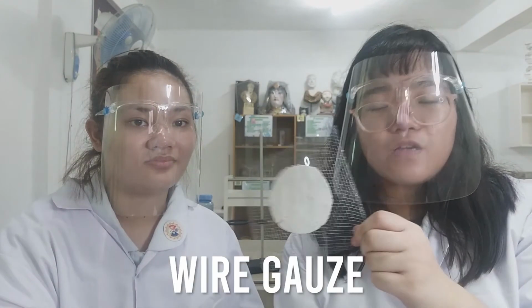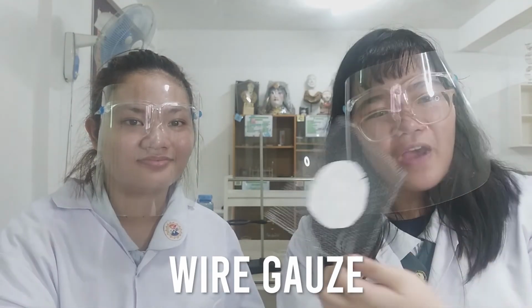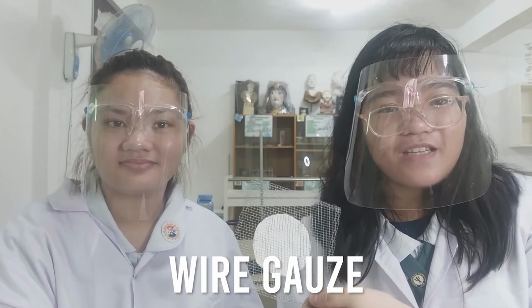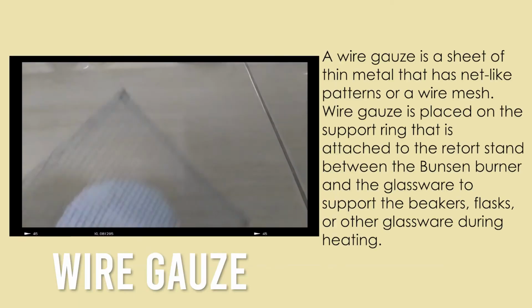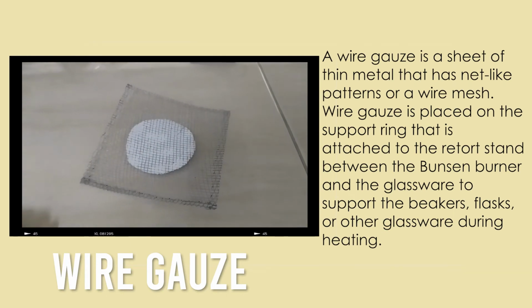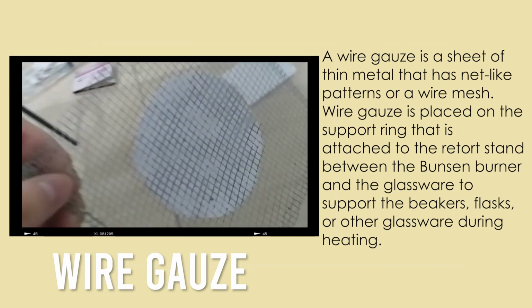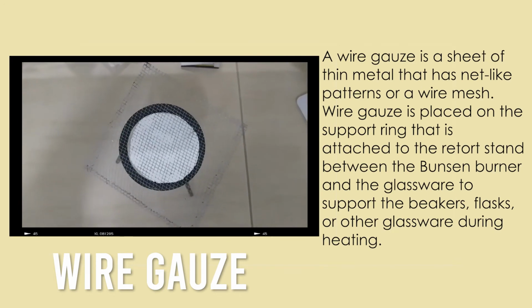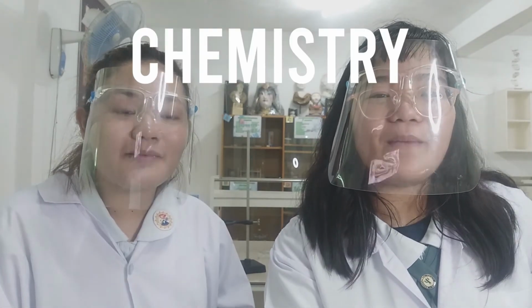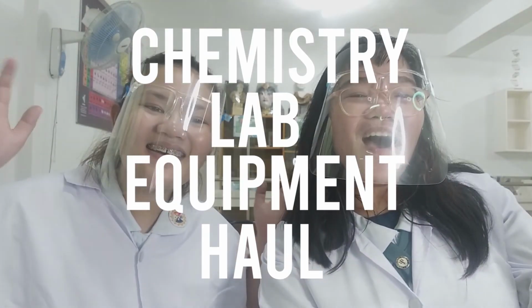Next up on our haul is the gauze. But do you ever wonder what this gauze is? What is the use of gauze in the laboratory? Well, it is an important piece of supporting equipment in the laboratory, as glassware cannot be heated directly with the flame of a Bunsen burner, and it requires the use of a wire gauze to diffuse the heat, helping to protect the glassware. And that is all for our chemistry lab equipment haul!